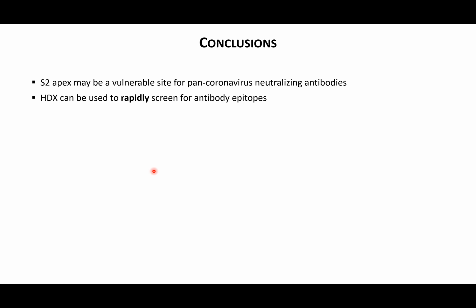What's your advice? Yeah, so this is absolutely something that we're diving into right now, as more and more of our proteins are coming from baculovirus. So I will say, just in regards to the spike protein, the glycosylations are really quite mapped out. There's been quite a few high-profile papers where we know what they are, and there is another HDX paper using the spike protein where they do search for the modifications and they do recover the peptides. So in some cases, you can allow it as a post-translational modification and then recover it.